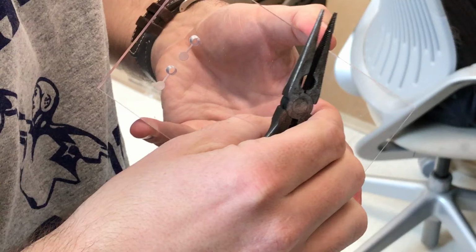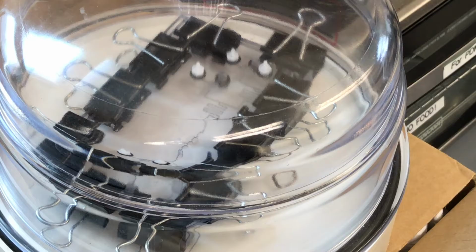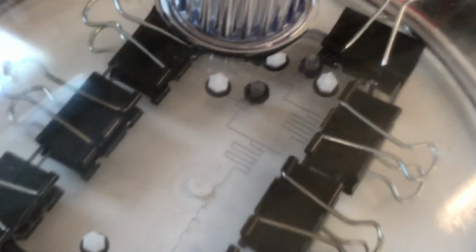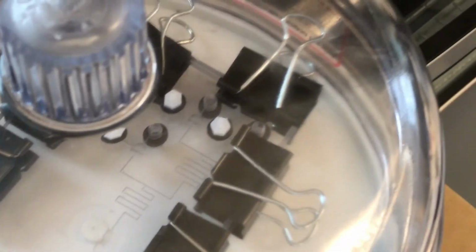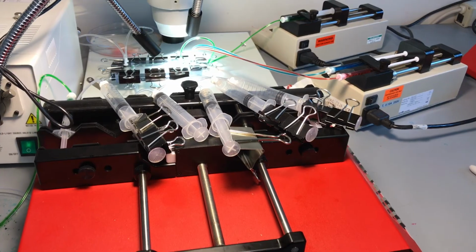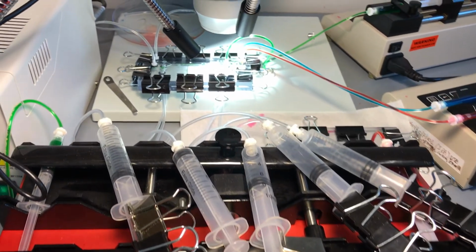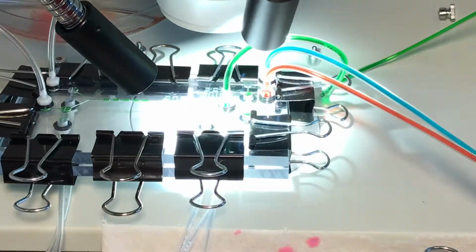The layer between the control and flow layer, etched in polycarbonate, is a thinner layer of PDMS. With the layers aligned and the PDMS between, binder clips are used to hold everything in place. The entire device is then placed in a vacuum chamber to remove any bubbles in the layers. The 5 syringes seen here control whether a valve is open or not. The syringes pulled back pull the PDMS layer away from the flow layer and allow fluid to flow freely.